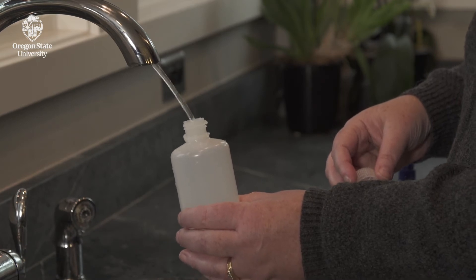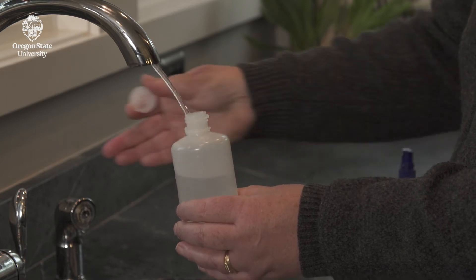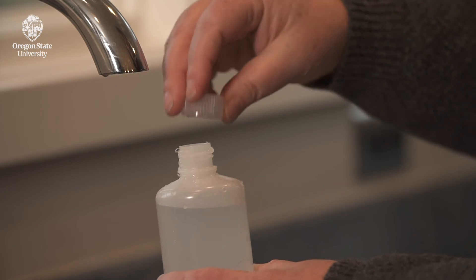Adjust the water pressure and slowly fill the bottle. Add at least 100 milliliters, or fill the bottle until only one inch of space remains between the water level and the lid. Cap the bottle.